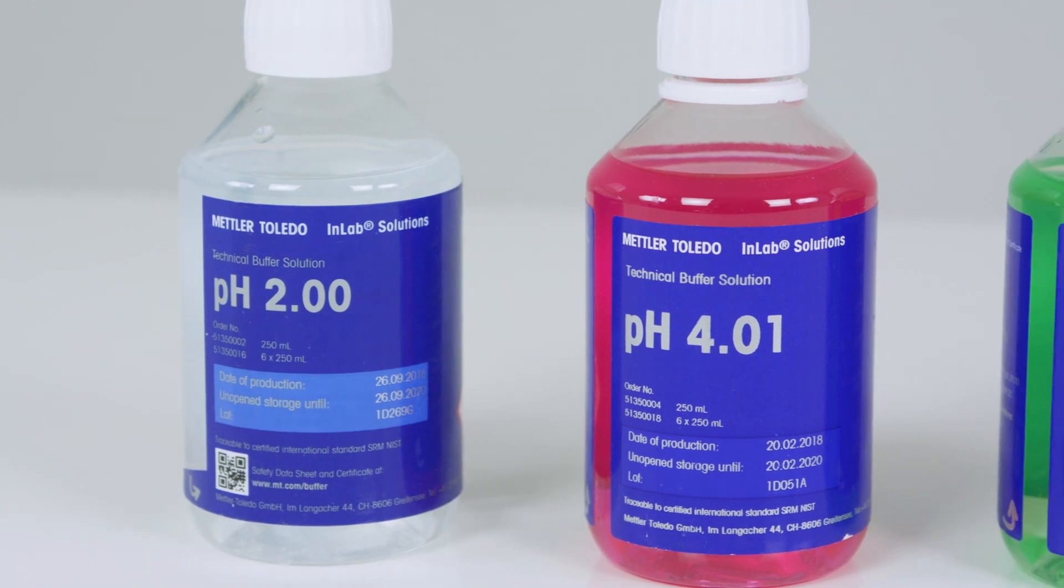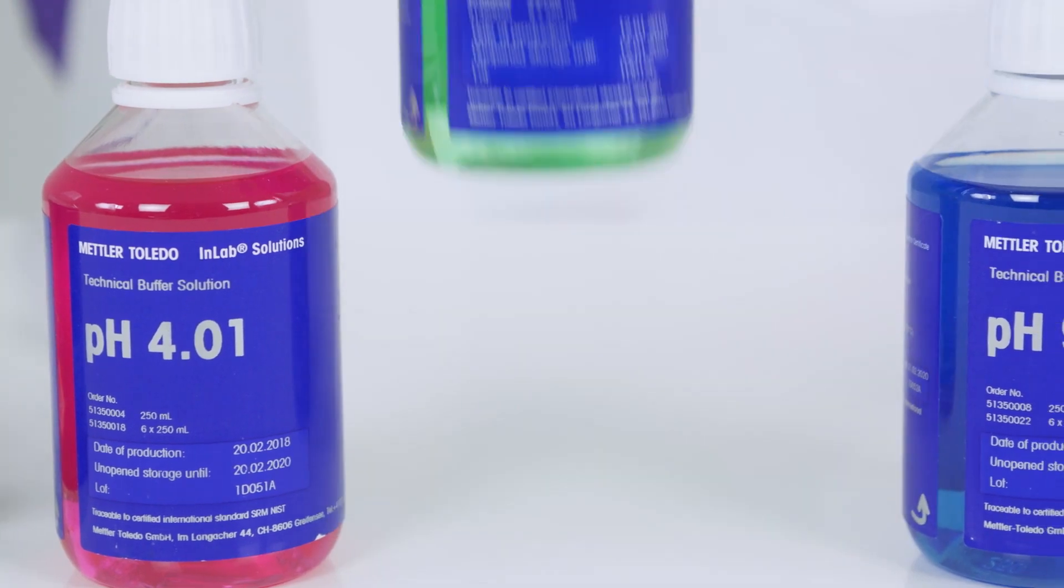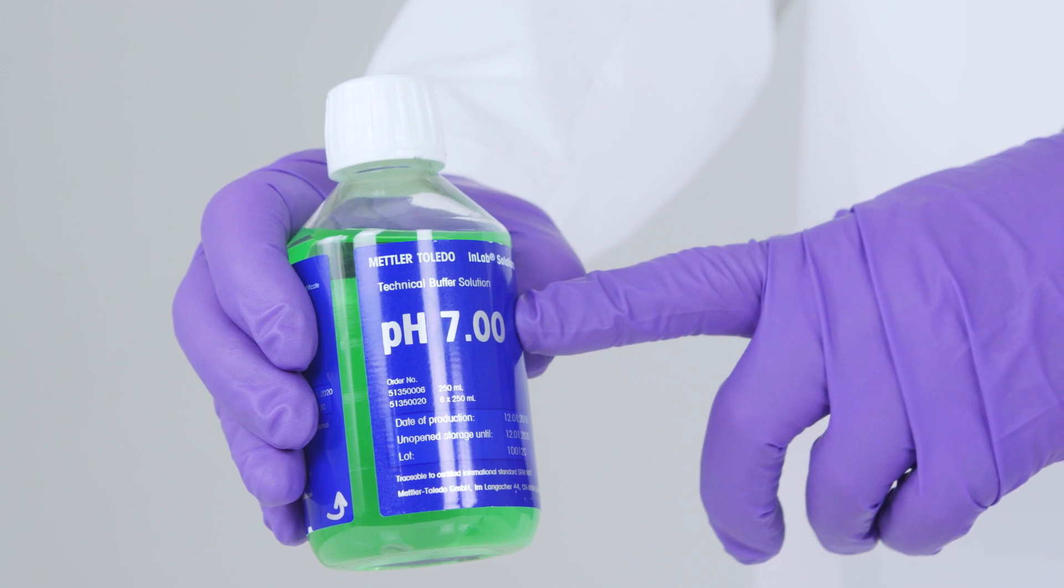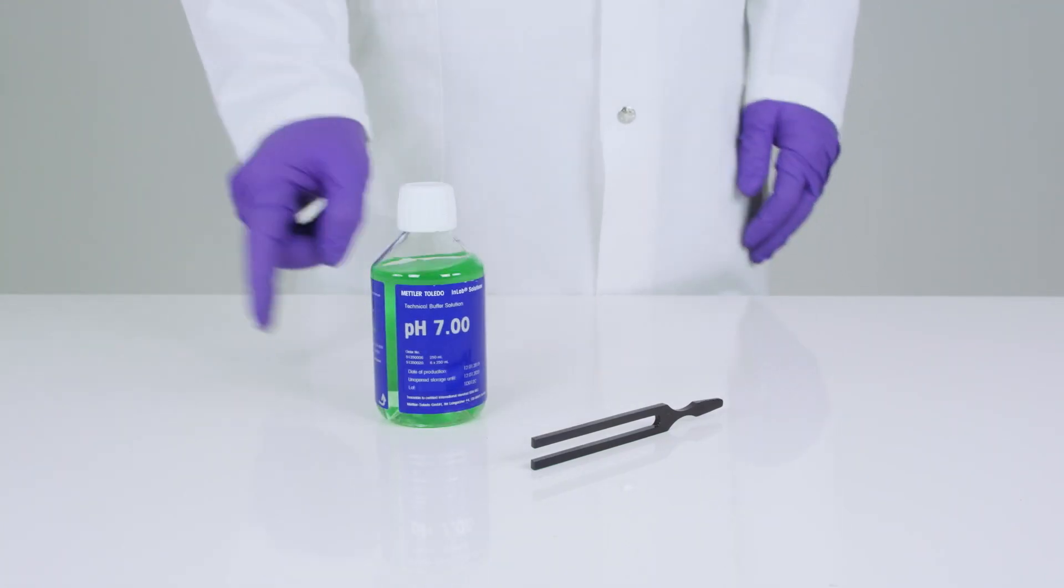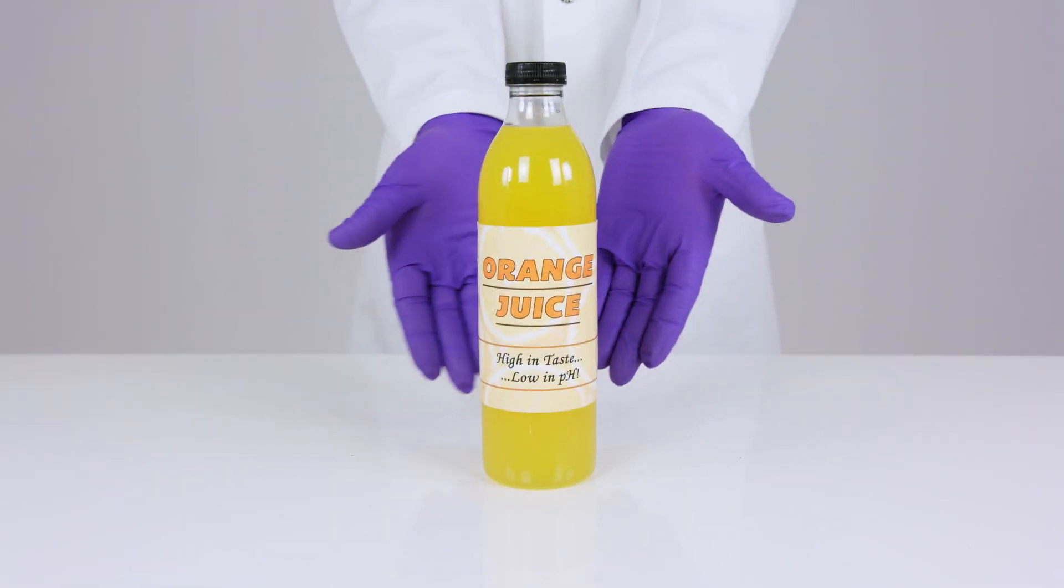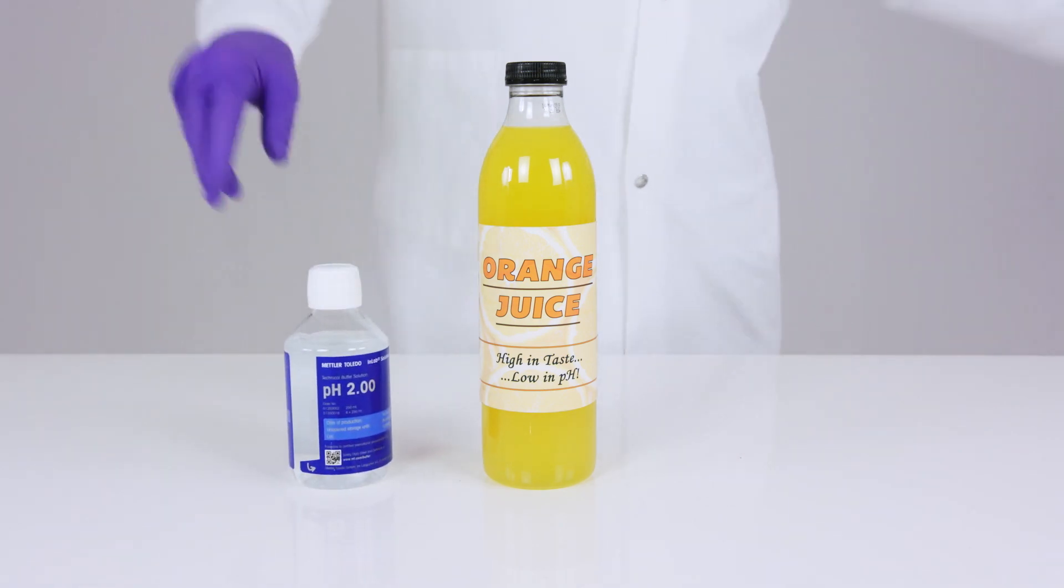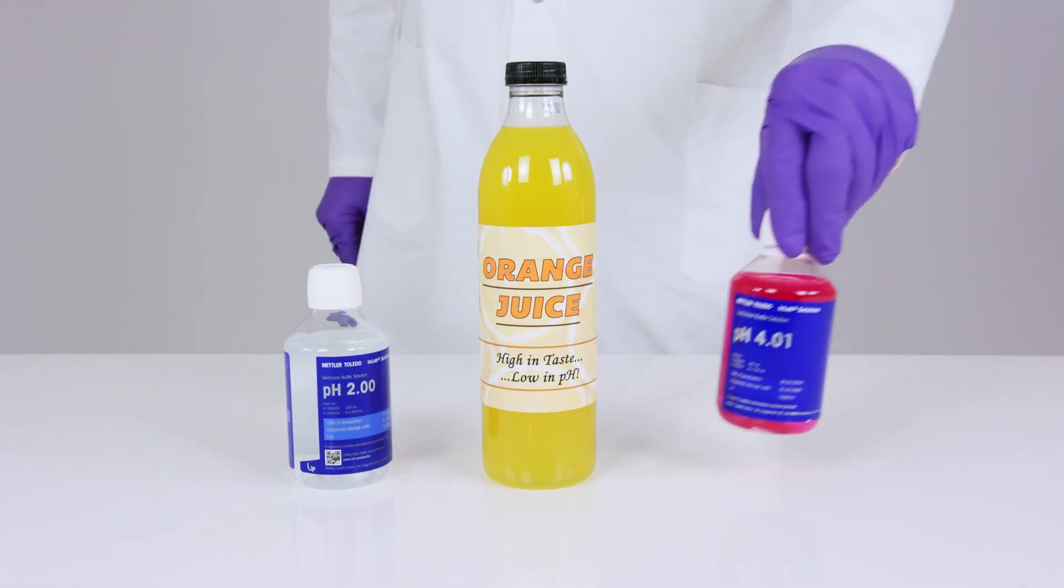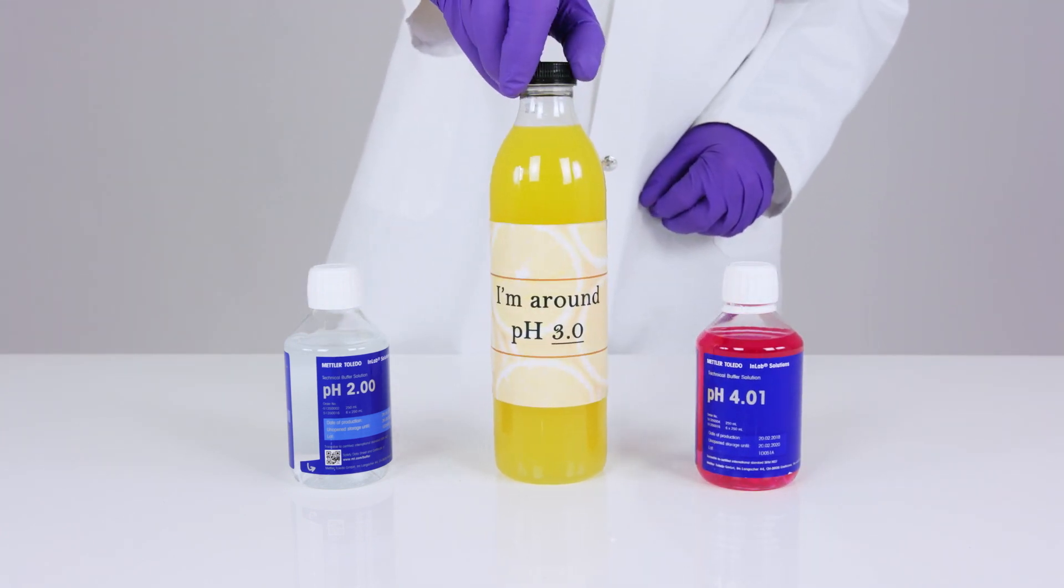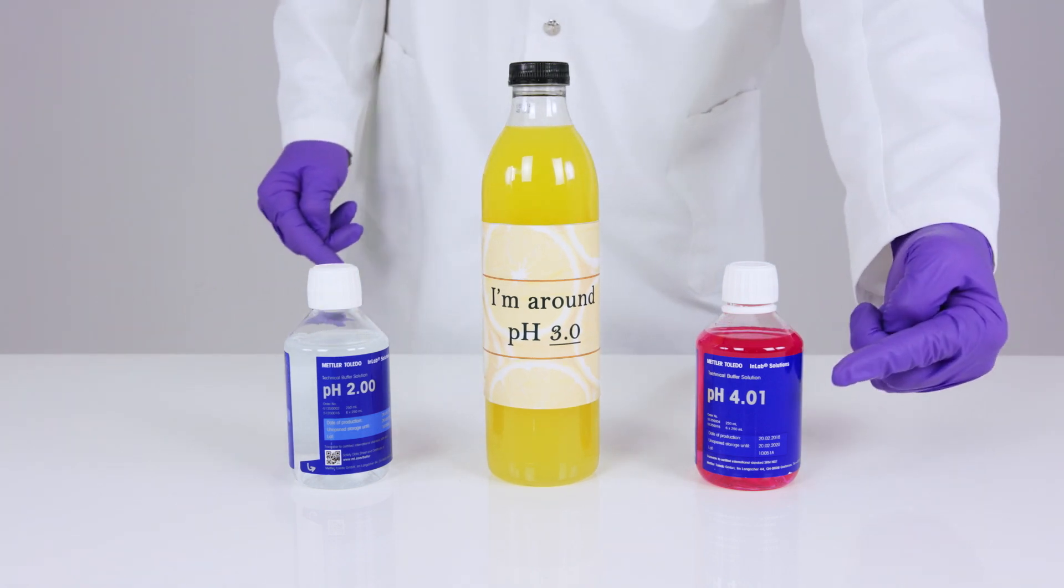The next step is to choose the buffers required to tune the calibration. Uh-oh, Hans! Sounds like more science! Buffers are liquids with known pH values, which act as reference points for the meter to compare its actual measurements, like with our violin and the reference pitch of the tuning fork. If you know roughly what the pH of your sample is going to be, then you may use two buffers for a two-point calibration. In this case, choose buffers with pH values that bracket the sample value. It's recommended that the difference does not exceed four pH units, so, for example, if you were measuring some nice fresh orange juice, which is about pH 3, then you would bracket with buffers pH 2 and pH 4.01 for best results.